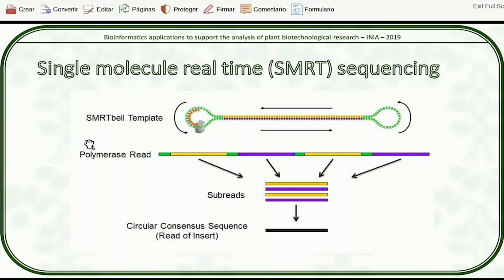What else can we say about this? Well, the fact that it has a much larger range of reads. If with Illumina we're talking about 300 base pairs maximum, here we're talking about a minimum of 3 kb, 3,000 base pairs. And lately, the average read length is reaching 15,000 base pairs. So it's really big. Now, there are some caveats regarding this technology.